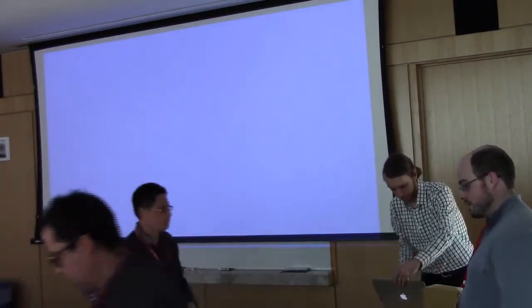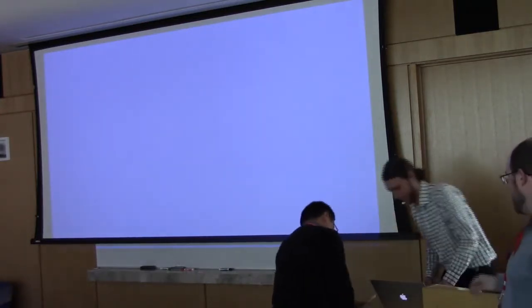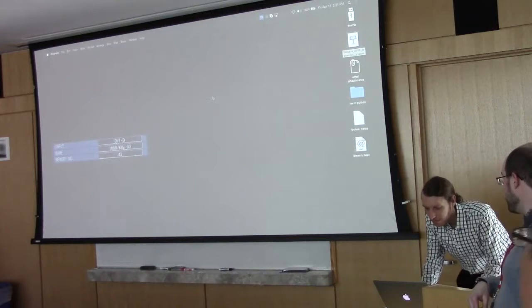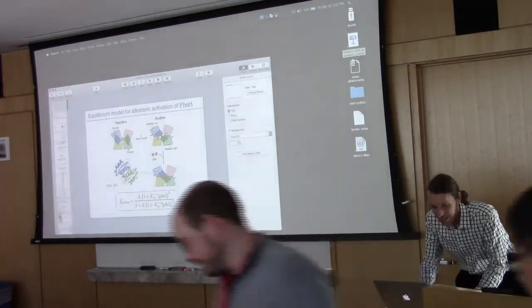Steve Musburger is a postdoc in Endo's lab at Princeton. He's an expert SAXS user. He's been using the facilities here at CHESS for 10 years now, something like that. Yeah, that's right. He's actually the one who first taught me how to set up a beamline at G1 many years ago. We were both graduate students, and he's going to talk to you about SEC-SAXS, which is no longer an exciting new technique, but now a very exciting established technique for getting excellent data quality out of your samples. And I believe you talked about some advanced processing techniques for SEC-SAXS as well. Yes. Take it away.